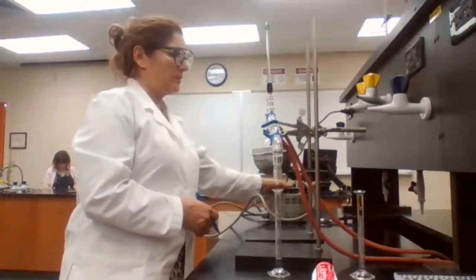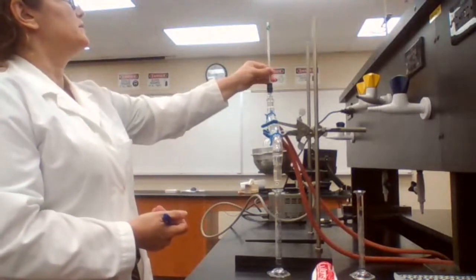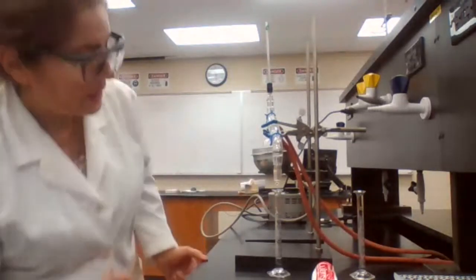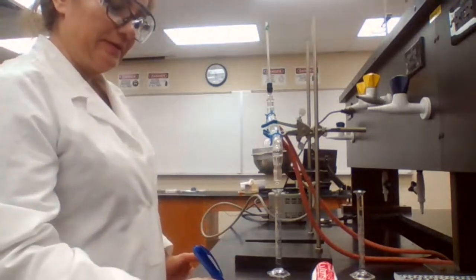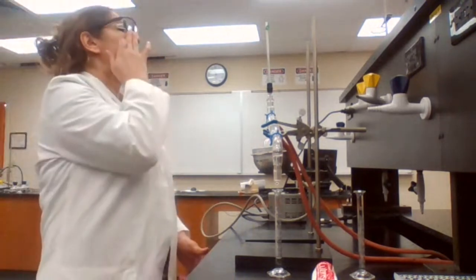I lowered the heating rate, so I get better separation. Now it generates less vapor, so it takes more time. Okay, 2 milliliters, 55 degrees.